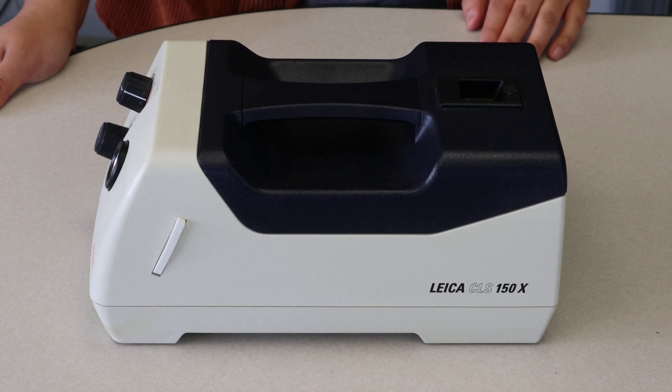Hi, this is Walker with Monday Scientific. Today we're going to be showing you how to change the bulb in this Leica Illuminator.